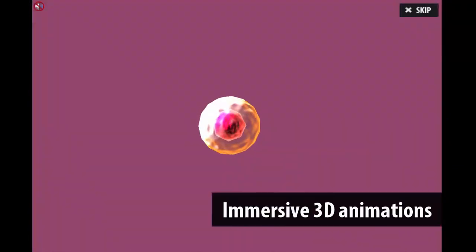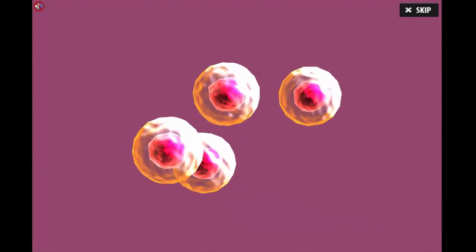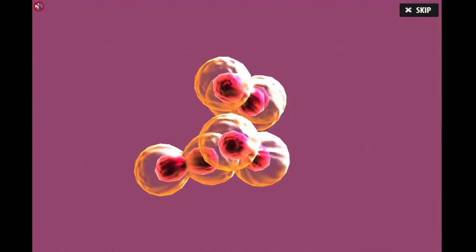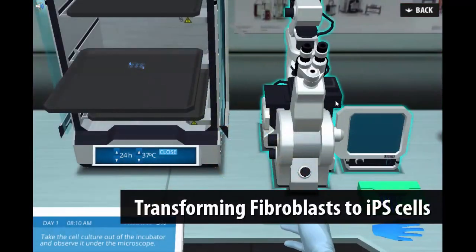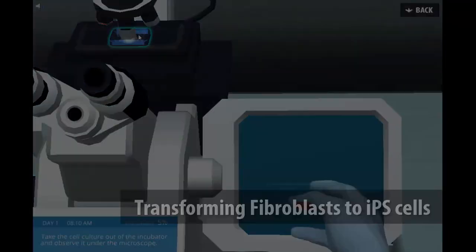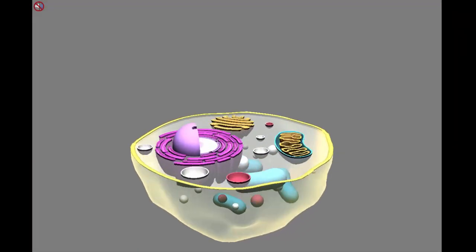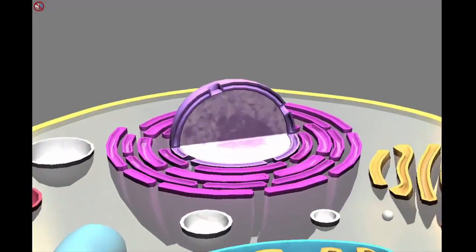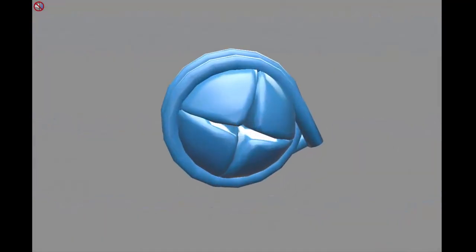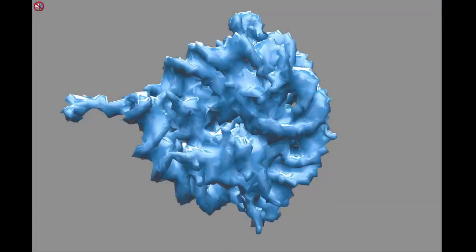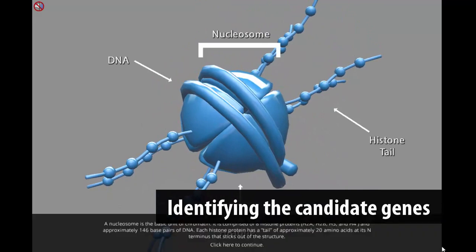Immersive 3D animations increase student engagement and understanding. First, students need to determine which transcription factors are important in maintaining stem-like features. By analyzing different gene expression between fibroblasts and stem cells, students identify the candidate genes.